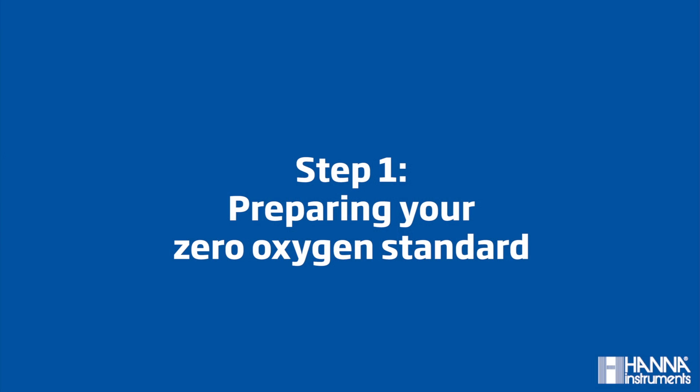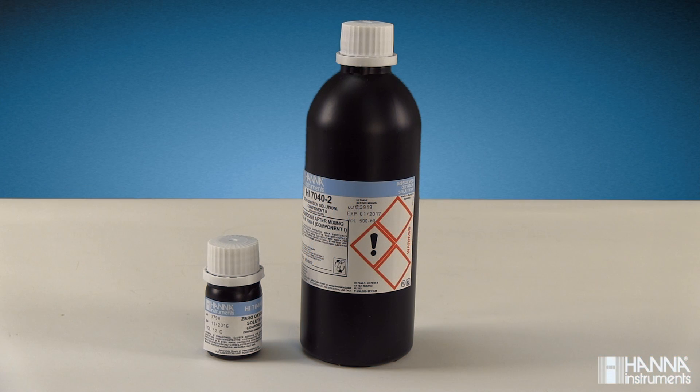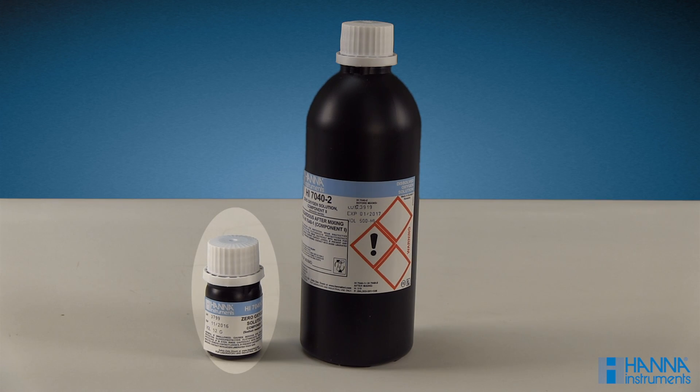Step 1: Preparing your zero oxygen standard. The standard kit contains two components, HI7040-1 and HI7040-2. Preparation is simple.